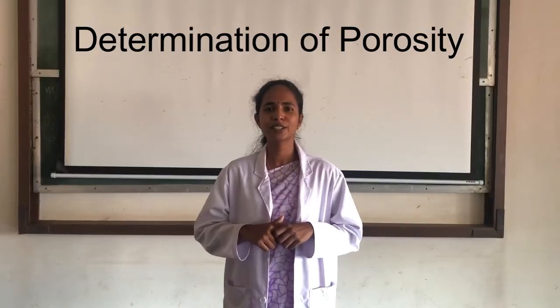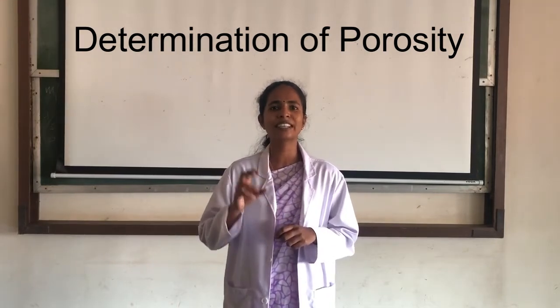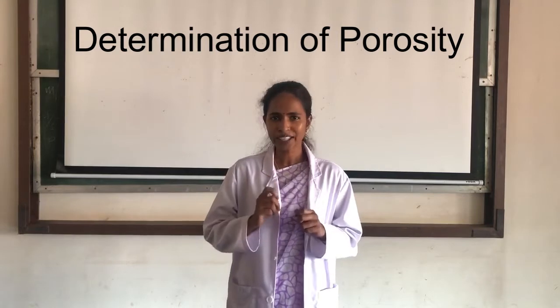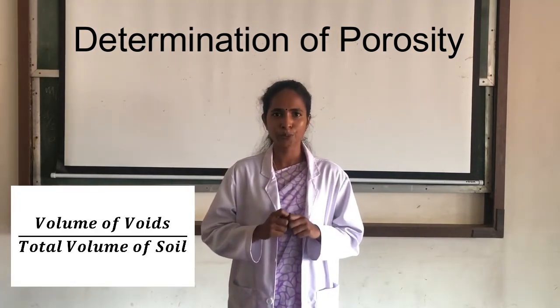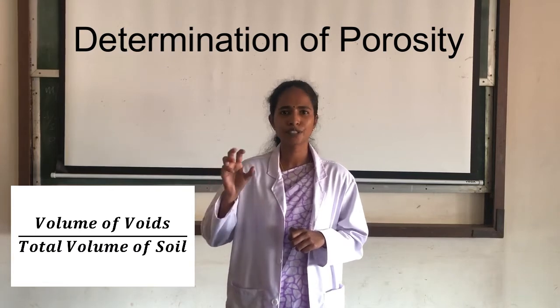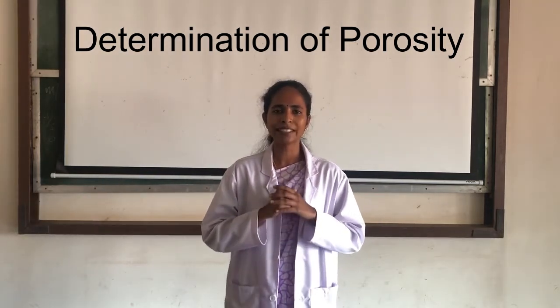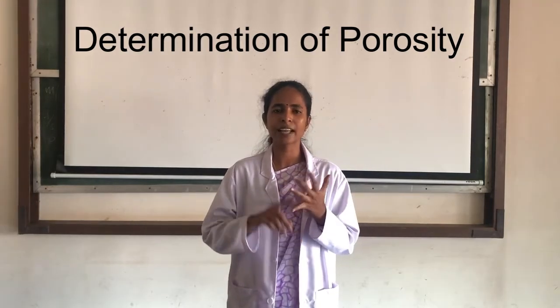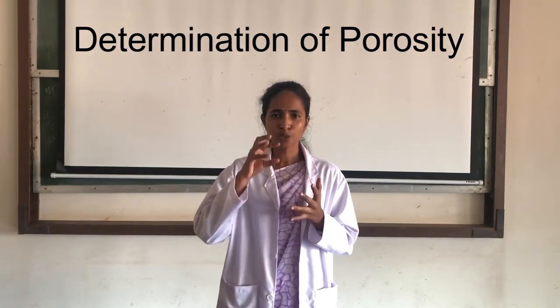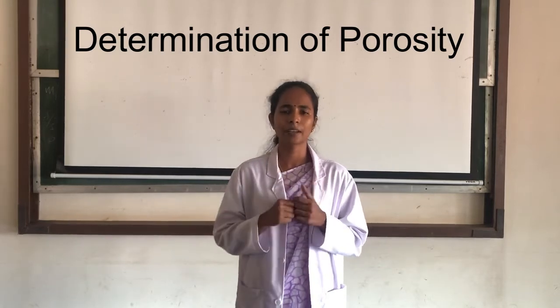Now we will see soil porosity, which is simply the percentage of pore spaces in a soil sample, or it can be defined as the ratio between the volume of voids to the total volume of soil. Generally, a soil sample consists of soil particles and void spaces in which air as well as water get trapped.